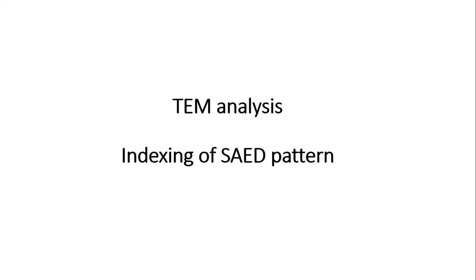Hello friends, today we are going to learn TEM analysis. In this, we will learn how to index a SAED pattern.